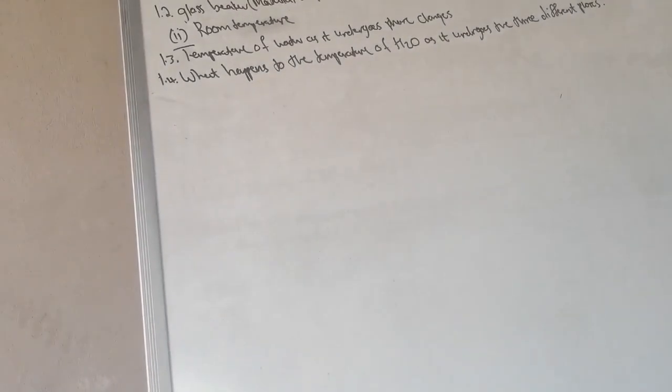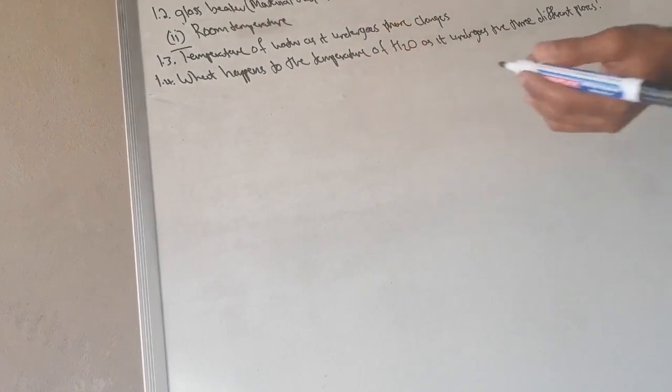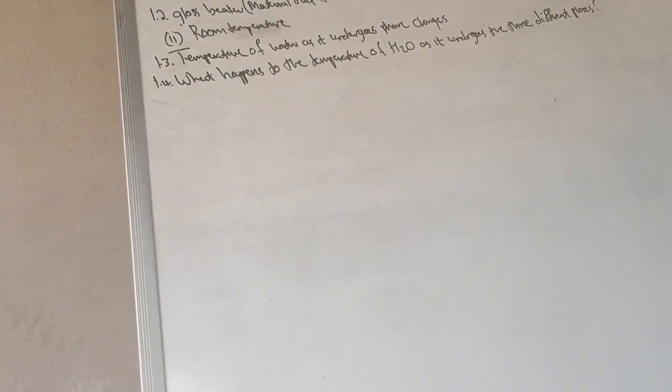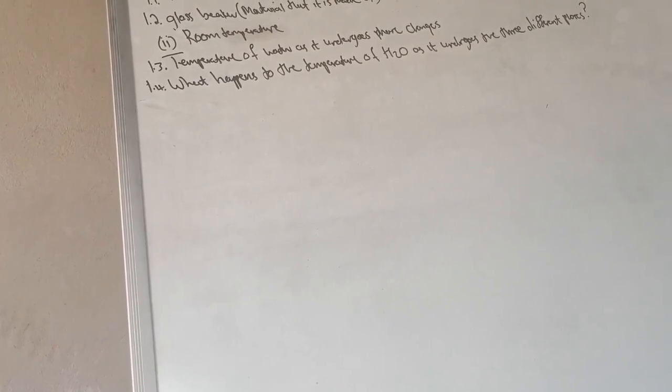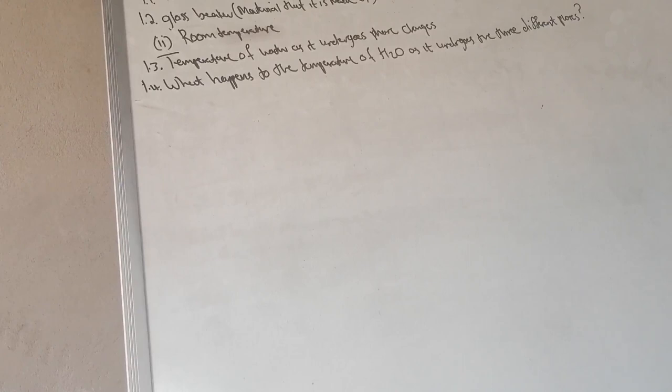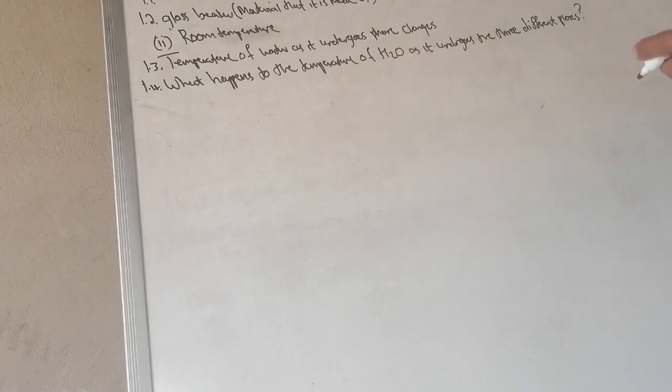So I'm going to try and lower the Apple phone that I use so that we can do that. Right. Let me just try to have it. As you can see from the experiment, they told us that time should be on the horizontal axis and temperature on the vertical axis, because time is independent and the temperature is dependent on time, because temperature rises with an increase in time. Right. So let us try to draw that.